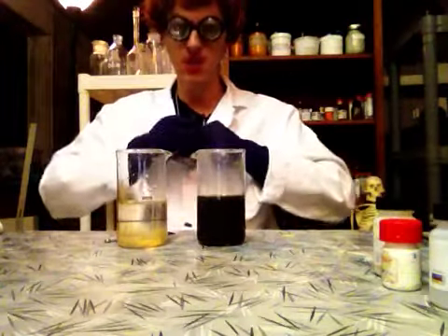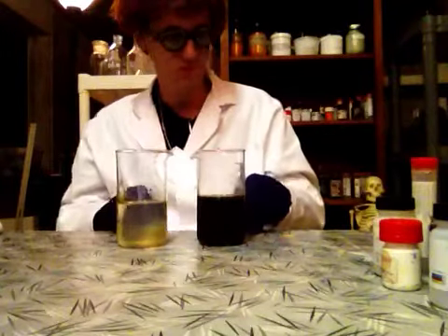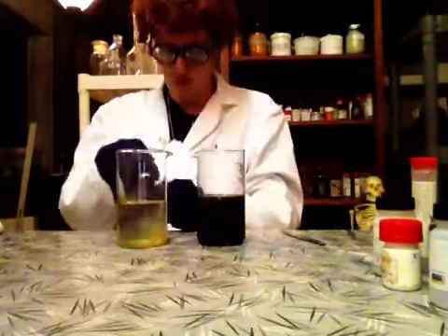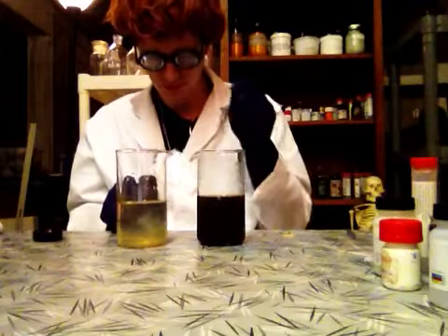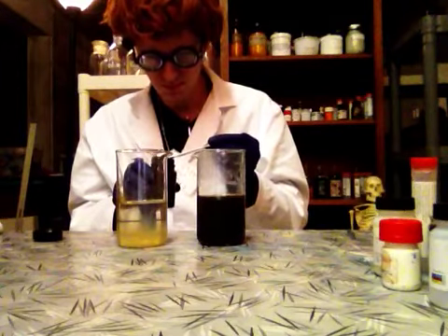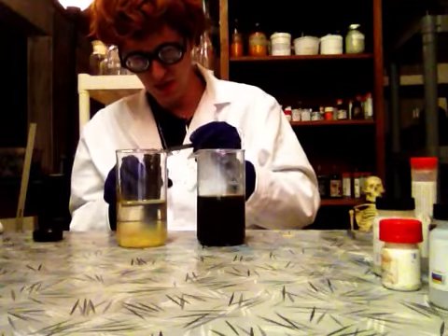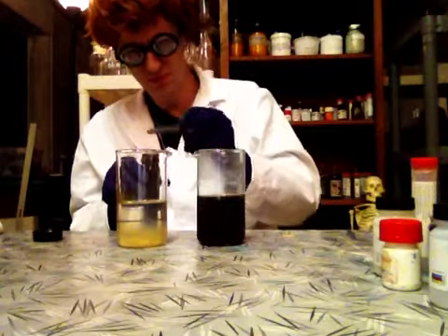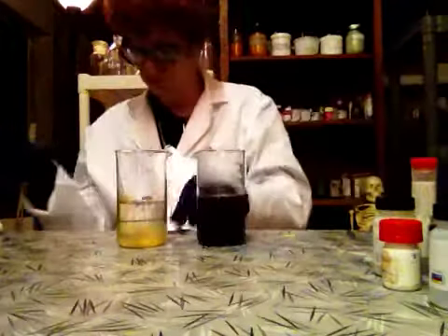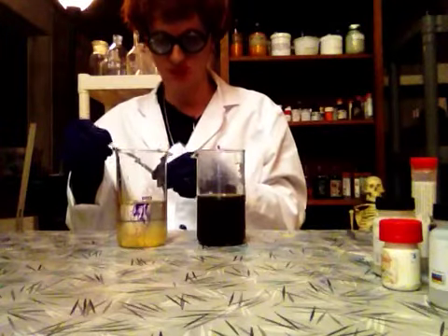Don't try this at home. These chemicals are dangerous. I'm a professional scientist, so don't try this at home. Methylene chloride. Just don't take much of that. Methylene chloride — don't take much. Methylene is dangerous. Dangerous. Scientific chemical, mixing up. Dangerous.